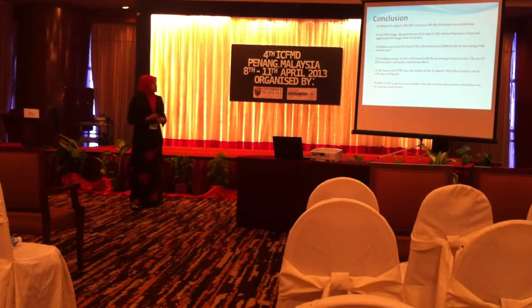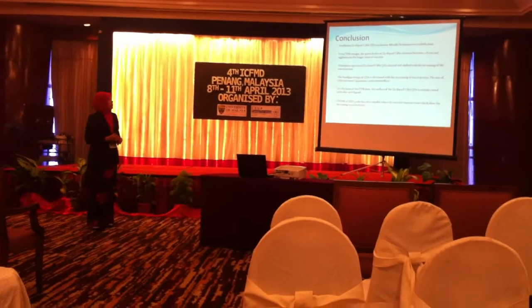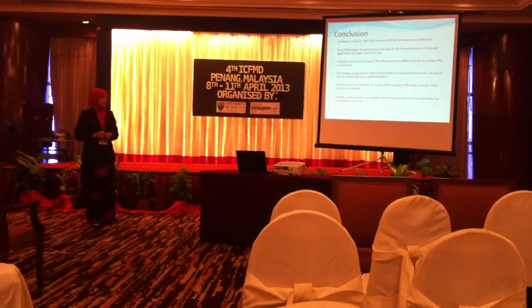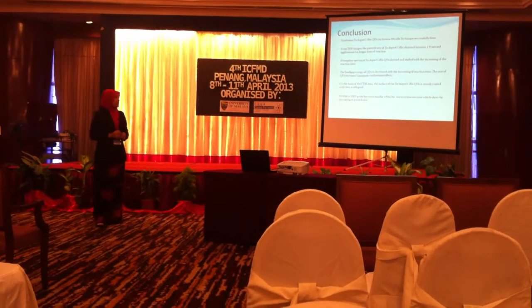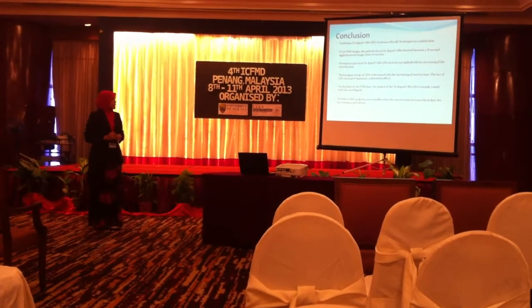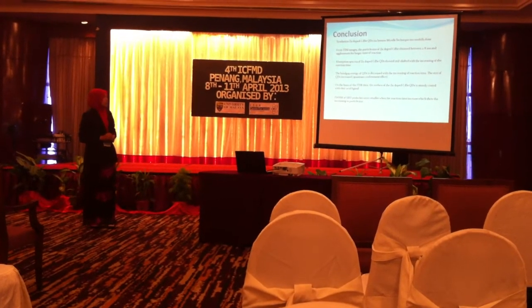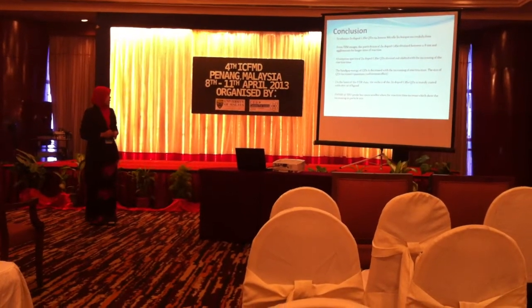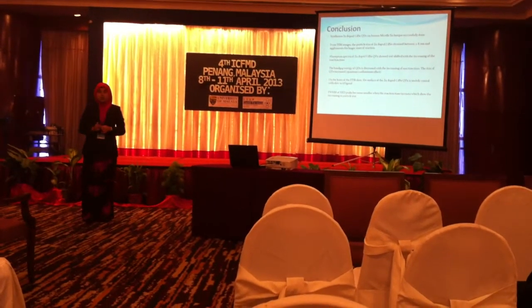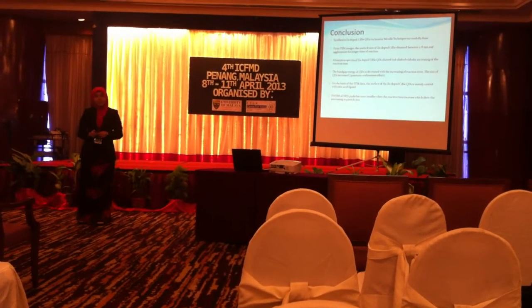And the absorption spectra of zinc cadmium selenide quantum dots show the redshift with the increasing of reaction time. The bandgap energy of the quantum dots decreases with increasing reaction time, and the size of quantum dots increases due to the quantum confinement effect. And on the basis of FTIR data, the surface of zinc cadmium selenide quantum dots is mainly coated with oleic acid ligand. And the last one, the full width at half maximum of XRD peaks becomes smaller when the reaction time increases, which shows the increase in particle size.